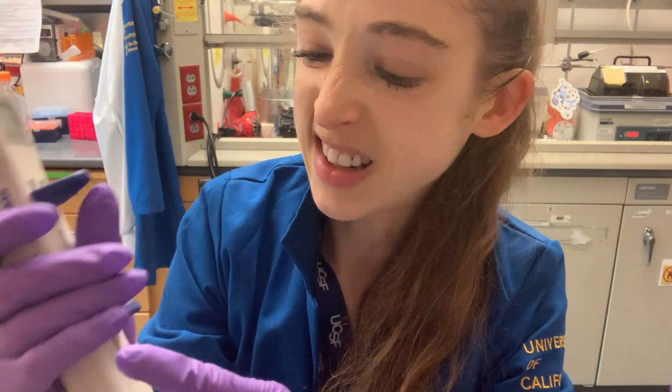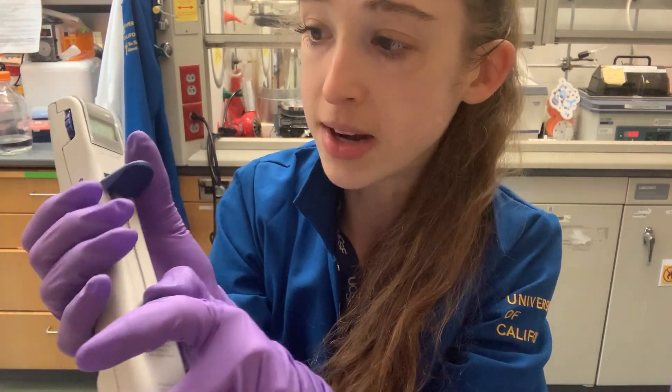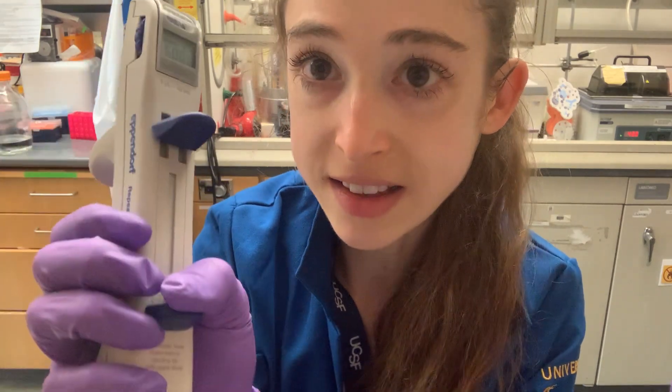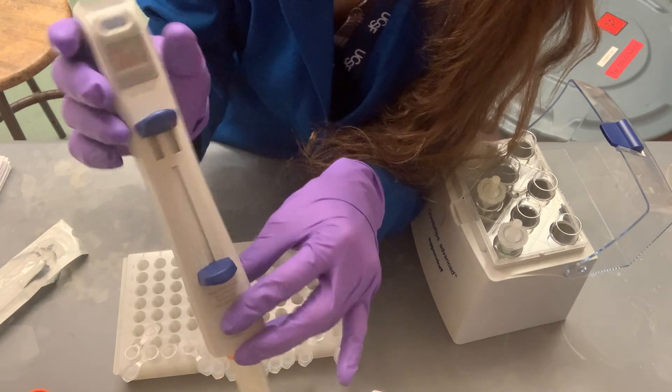Sometimes the tip doesn't go in right and you get an error message. Don't freak out — just eject the tip by pushing down on the bottom and it'll come out. Then try again: make sure you get it straight into the center of the hole, hear that click, and push down. Now you're snapped into place.